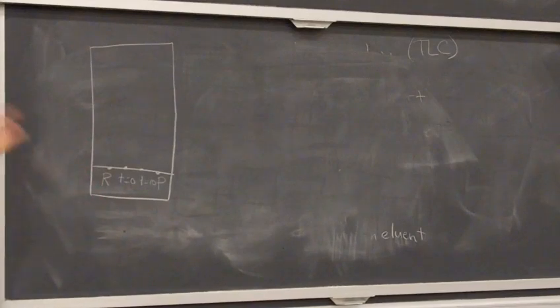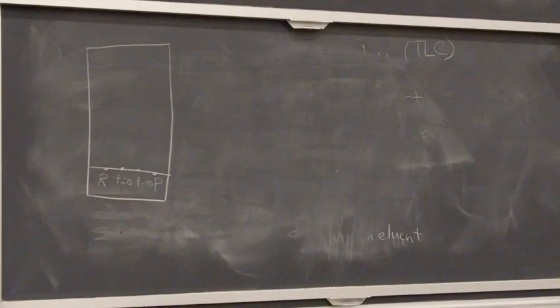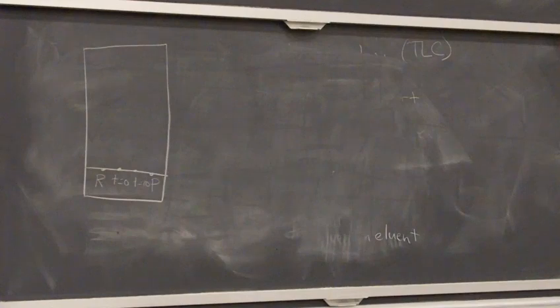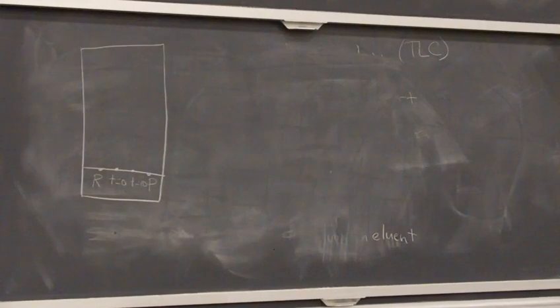When you record TLC plates in your notebook, you draw them vertically, okay, and you record them life size. So you want them exactly the size of what they are in real life. Typically, with a research notebook, you would probably tape them in. However, we don't want you transporting TLC plates back and forth. So most likely your lab prof's going to have you draw vertically, life-size, what your TLC plate looks like. Put all the measurements for your RF values on there, and either keep your TLC plates in your lab drawer or dispose of them in glass waste, because they're silica, so they go in the glass waste. Okay.